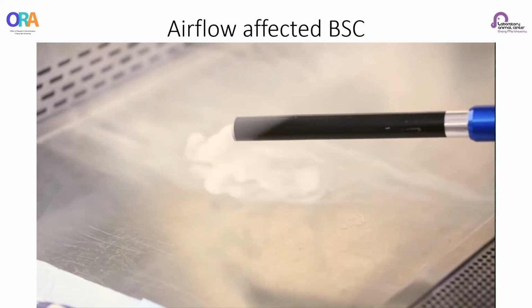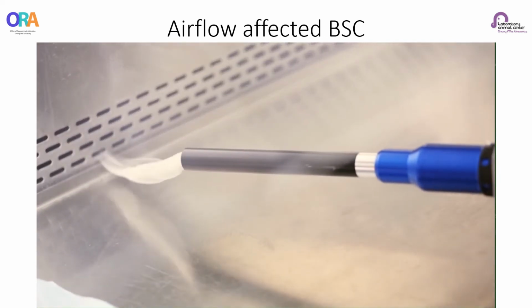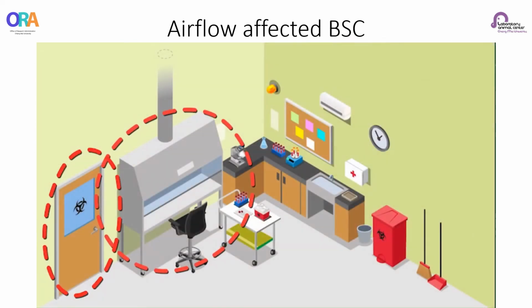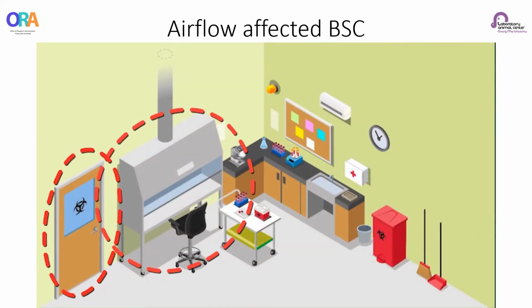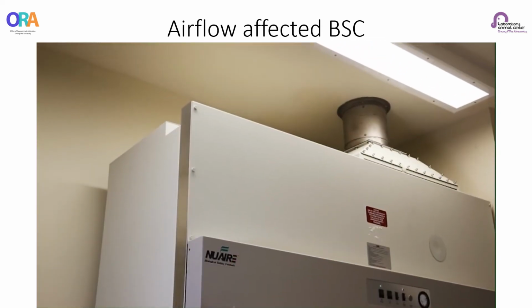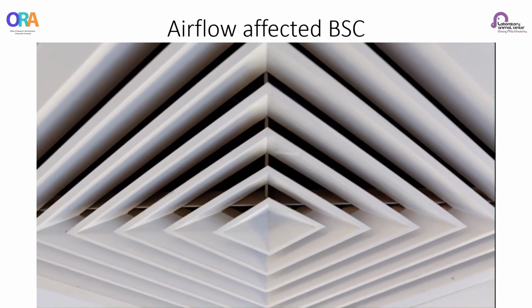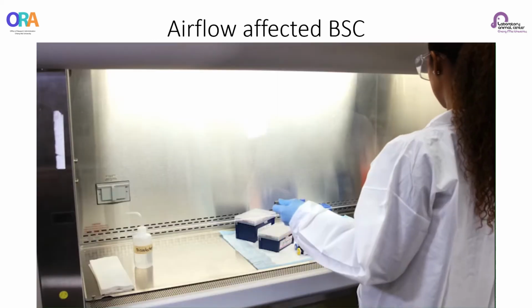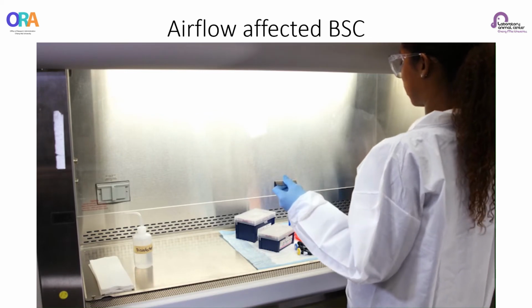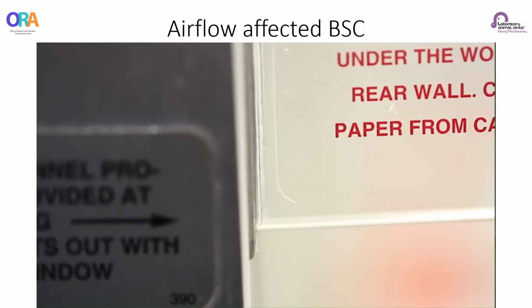The physical location of the BSC can affect the airflow as well. Placing a BSC too close to a doorway can cause the air to be drawn out of the BSC when a door is open. Placing a BSC too close to an HVAC supply vent can also interfere with the BSC containment.